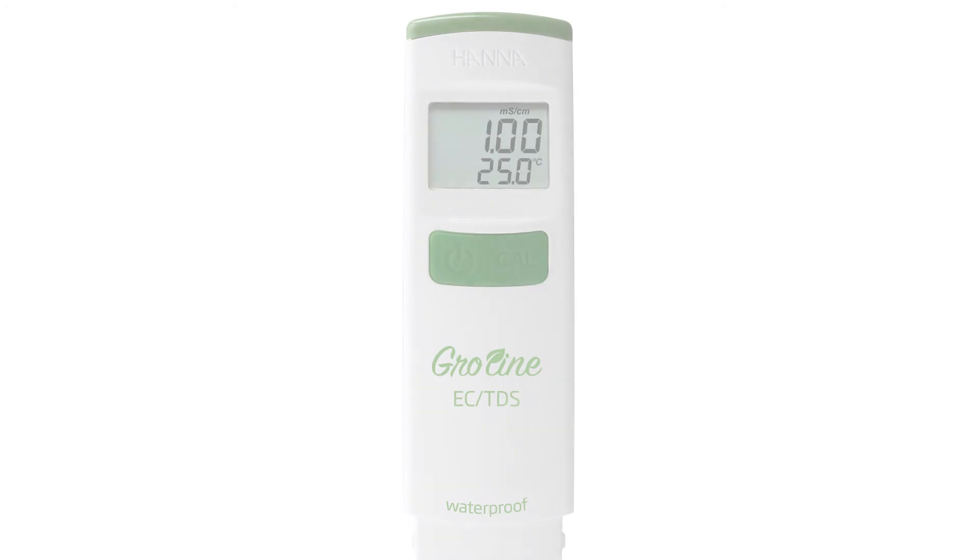Hey guys, welcome to the HANA Lab. Today we're going to go over the waterproof HI-98318 GroLine EC-TDS and temperature tester for hydroponics.